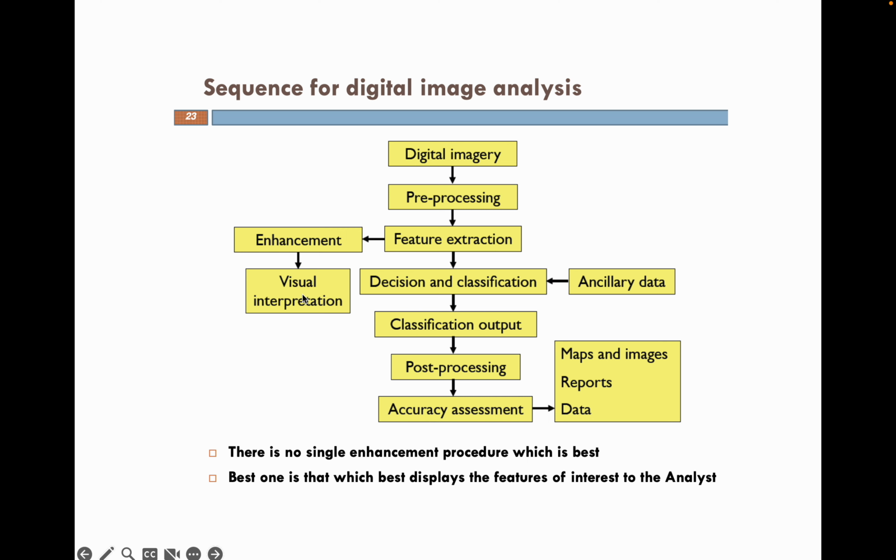You then do pre-processing. If you were trying to analyze for a particular color, you could shield out all the other colors and just focus on that one. That's something you can definitely do in ImageJ. Pull out the features you're interested in, enhance those if necessary. Interpret, classify, yeah, all these things.